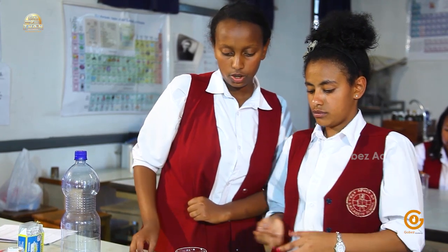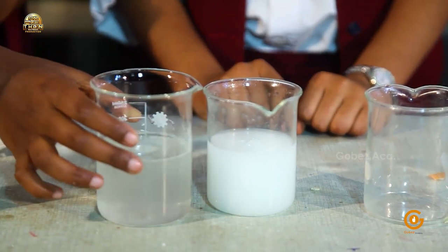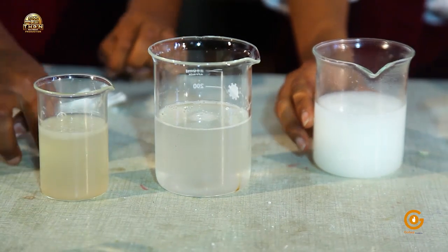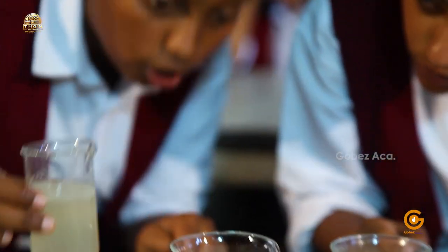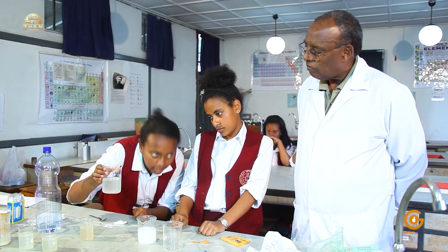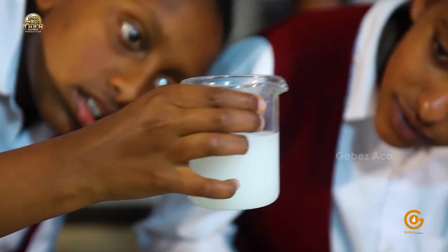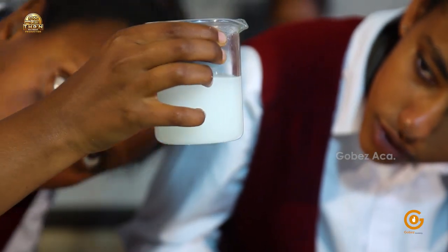So let's compare it. We have the baking powder here, or the sodium bicarbonate. We have the table salt, or the sodium chloride. Then we have the ground sugar, the experiment they carried out earlier. So we can still see a bit of the sugar left undissolved. Yes. Okay, let's see the table salt. Do you see any suspensions left? No. Okay, yeah, it's almost completely dissolved. How about yours? Well, we can't see it because the water has been changed by the baking powder, but I think it has dissolved. Yes.